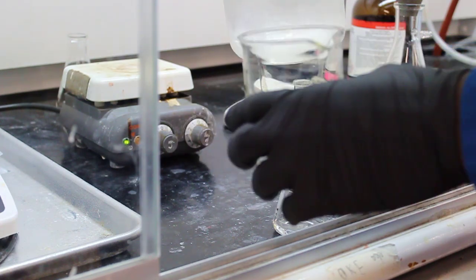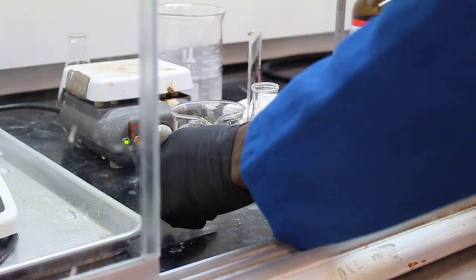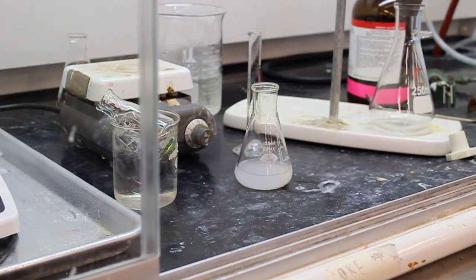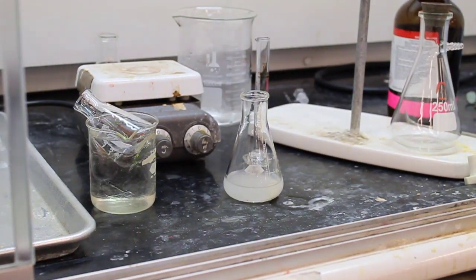Some of that product solid has fallen out of solution — it's recrystallized. They're also going to add some ice cold water. Now they're chilling that ethanol separately. We're waiting for the vacuum filtration system to be set up with a Buchner flask and funnel hooked up to a vacuum pump.